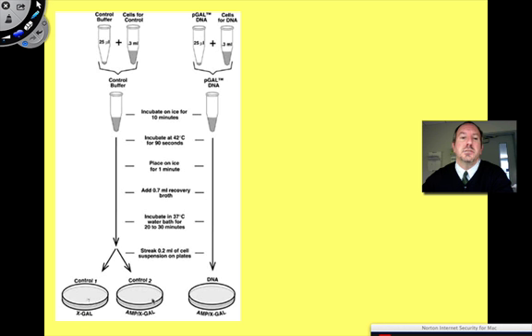If you look over here at this petri dish, if you took E. coli, again, and you grew it on this plate, and it didn't grow, there was no growth at all, you would say, gee, I wonder why they didn't grow, they're dead. And you're like, well, there's ampicillin there, which must mean that they're ampicillin negative, meaning they're not resistant. So the trick is, can we make that same E. coli, we're starting with the same E. coli, can we make it to where they not only live on ampicillin, and they also make lactase?